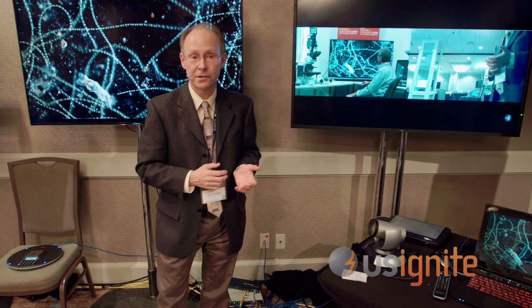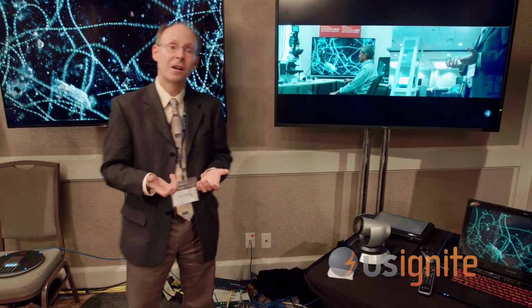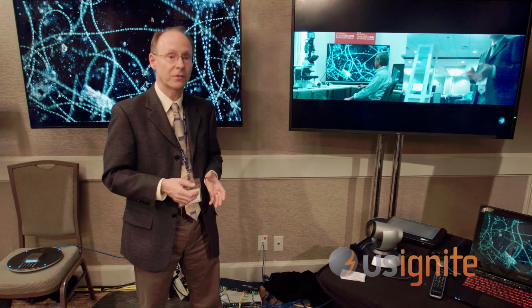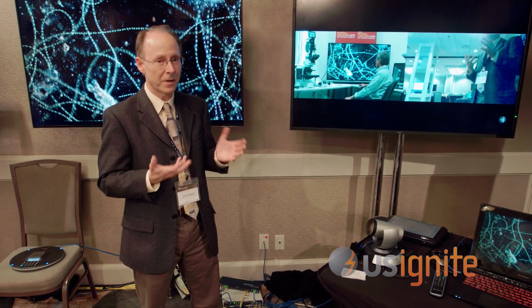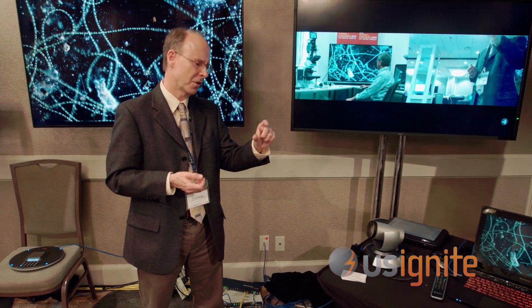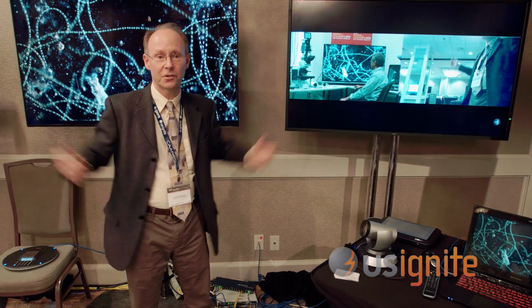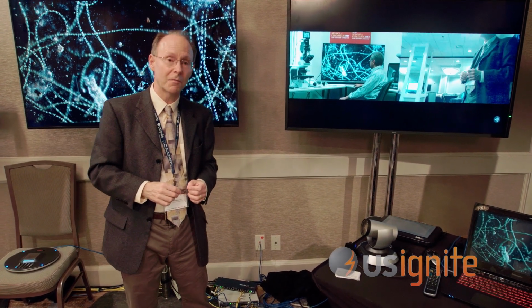And what we're finding is that students are really engaged in this new type of experience. Students may have looked at a microscope before, but it hasn't really been interesting to them. One of the students said, yeah, I've looked at a microscope, but the image is only this big, and we're bringing it to them in a high definition or ultra high definition screen form.